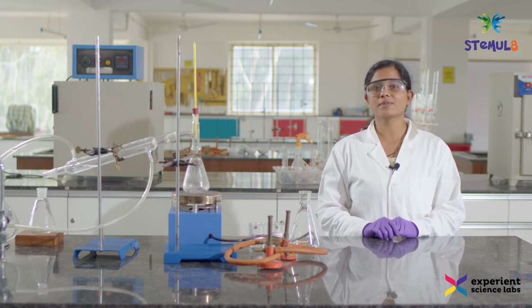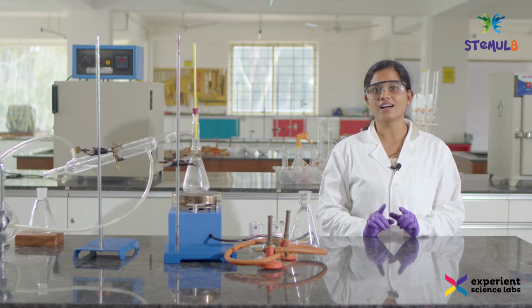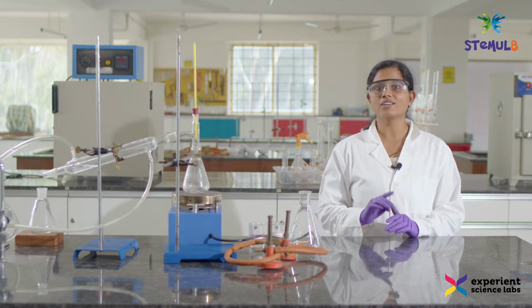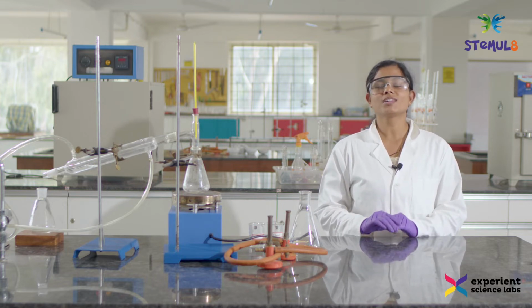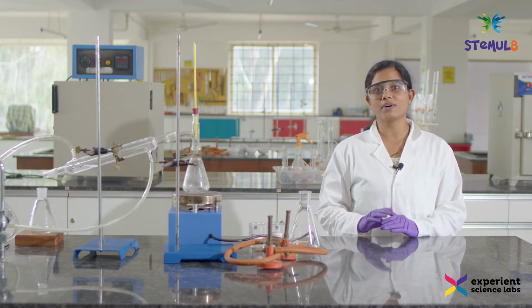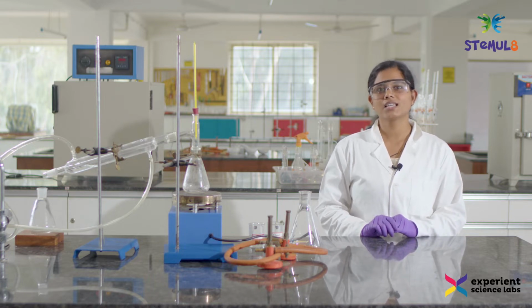So this particular experiment that I'm going to demonstrate is very important in large-scale industries like petrochemical refineries and also in purification of solvents. So what is this experiment? This experiment is separation of miscible liquids by distillation. So what are miscible liquids?